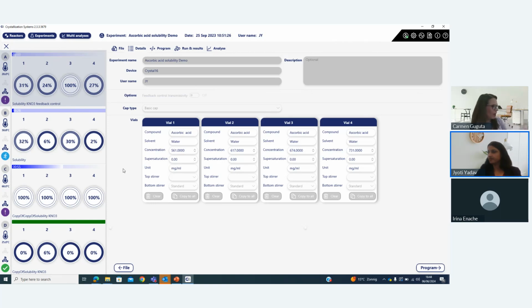Sorry, I remember while I was listening to this training, you mentioned, Jyoti, in the beginning the recommended stirring between 500 and 800, but it highly depends also on the viscosity of the solution. For very thick slurries, very viscous, almost honey-like solutions, usually what we say is go to lower RPMs. So 100, 200, maximum 300, even. So don't go too high.